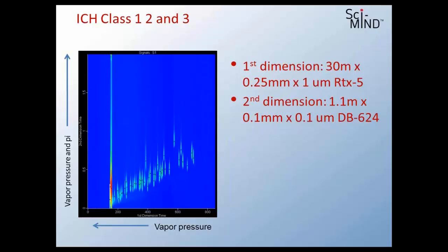And what that does, and if we do some data analysis on that, that actually gives us this 2-dimensional chromatogram that actually allows us to bring 2 sets of chemistries to bear to get the selectivity. You could see from the fast examples we did before, we couldn't get the selectivity. We couldn't get what we needed in order to generate the full resolution. Now this one's a bit slower. This is about a 15-minute separation, and then we can see some separation of the peaks. But even with this multidimensional one yet, we haven't quite separated everything. You can see some of those big spots there are overlapping.